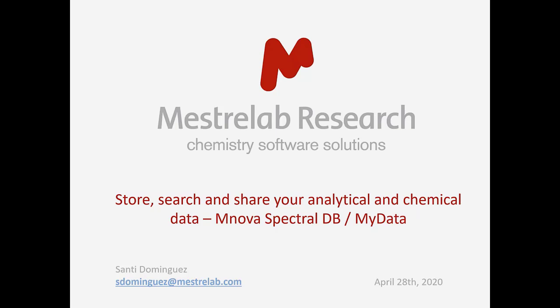And today, as part of our COVID-19 training series, I'm going to talk to you about storing, searching, and sharing your analytical and chemical data. And this is something that we do with plugins that we call either Mnova Spectral DB or MyData.